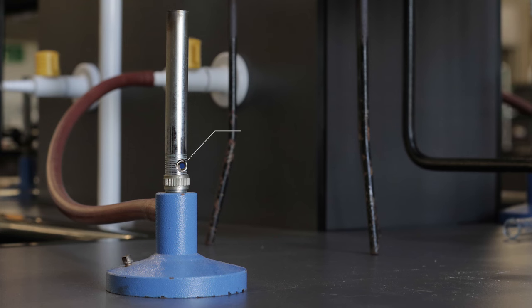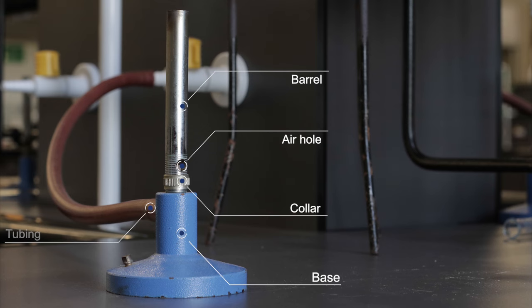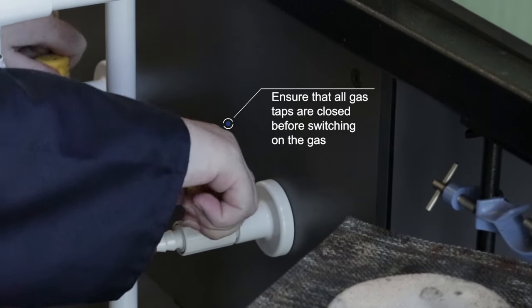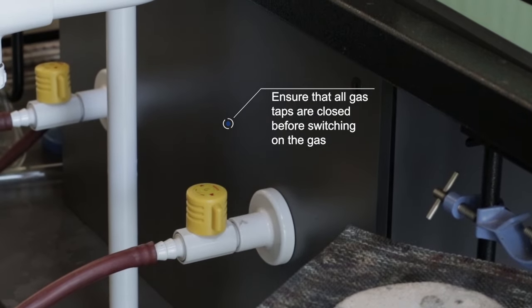A Bunsen burner consists of an air hole, collar, barrel and base with tubing connected by the base. Make sure that all gas taps on the bench are closed first before opening the gas supply to the bench.